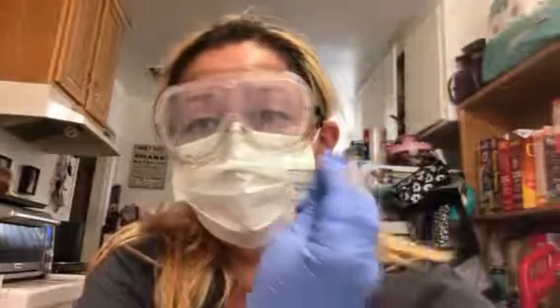So at this point, I think I'm done with the video because I'm not going to videotape myself looking at the microscope of the slide. But you can see the slide there. That's what I'll be taking a look at. And I have my microscope all ready. It's pretty much ready to go. And I'll be using the high power.